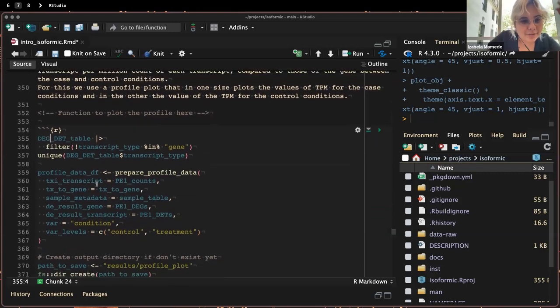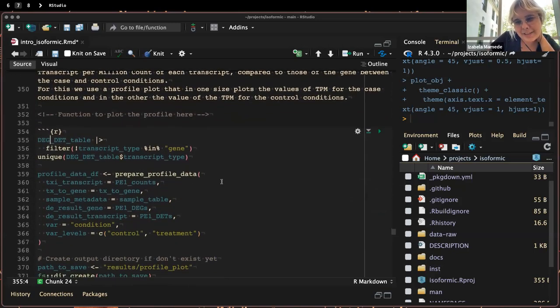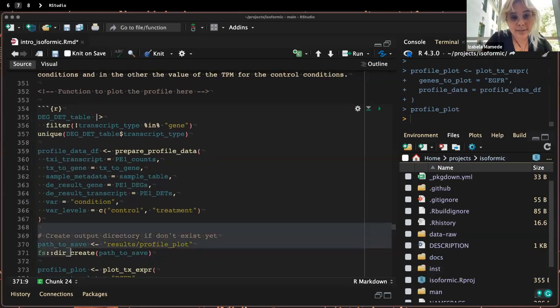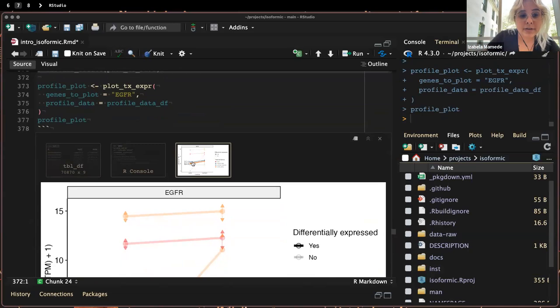Just a second before you do this plot, there's a good question from Wes. The negative binomial model assumes raw data coming in. Do you think that at transcript level, how different transcripts are more transient or sensitive to each other might make the technical batch effects louder when compared with the experiments? Yep. And that's something that we noticed a lot, that we have a lot of experimental batch between the experiments. For patient data, you need to be very careful when selecting the data set, especially because of that. If your focus is a transcript level analysis, the hands of the person doing it and the things that are a problem but not that big of a problem at gene level are going to show up more.